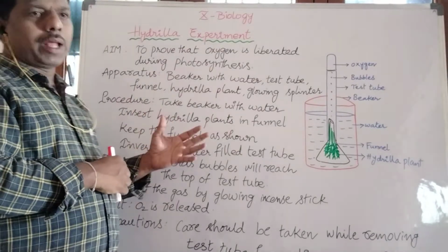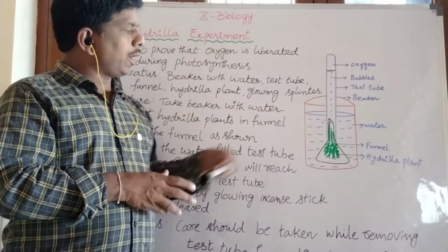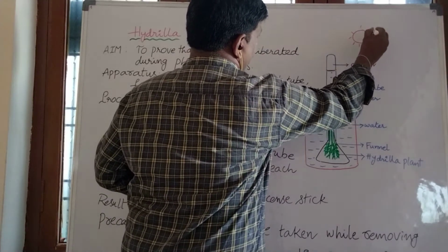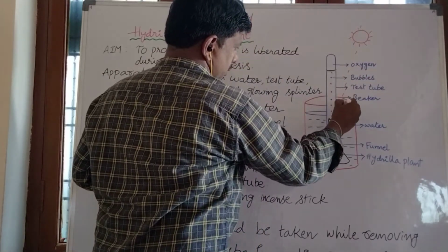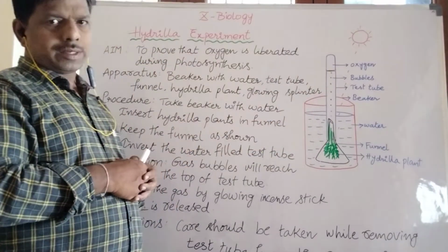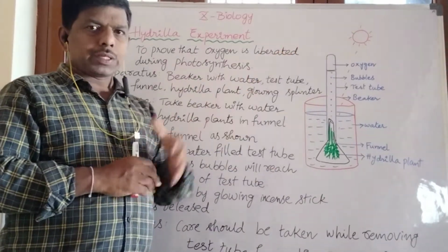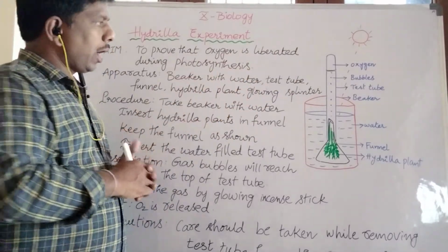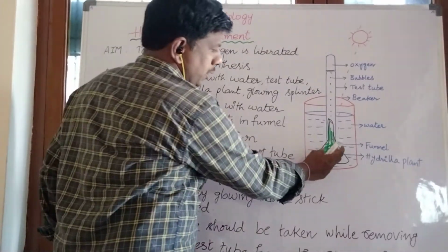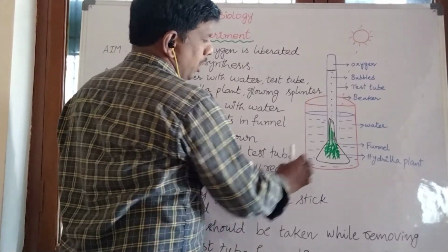So after some time, the plants which are present in the stem of the funnel, what are the plants? Hydrilla plants. Those Hydrilla plants will receive the sun rays. Sun rays will fall on the Hydrilla plants. By receiving those sun rays, the Hydrilla plants will perform photosynthesis. So if we give 2 to 3 hours outside, that means in the sunlight, the sun rays will enter into the funnel, and the Hydrilla plants will receive the sun rays and the temperature. Then they will perform photosynthesis.